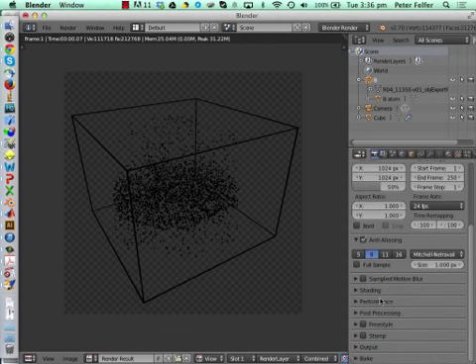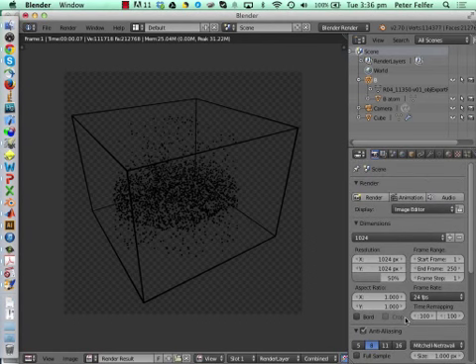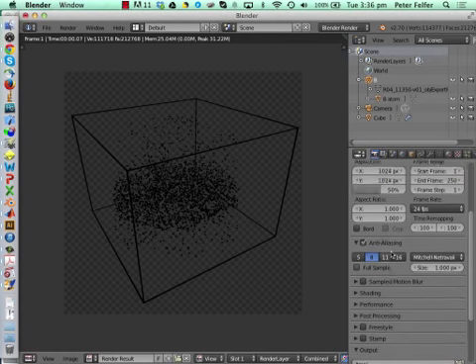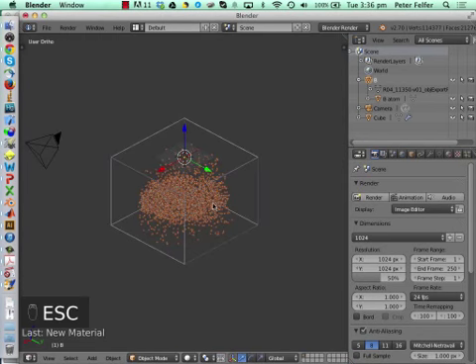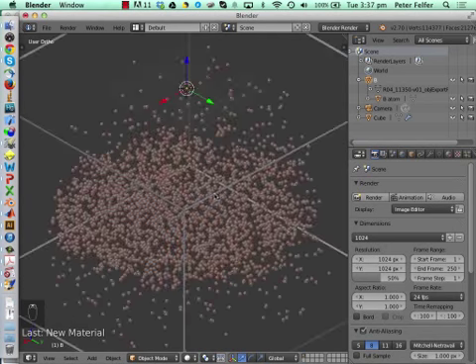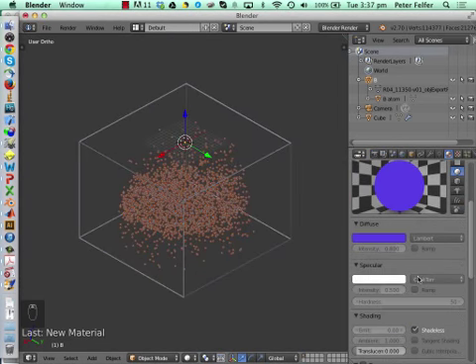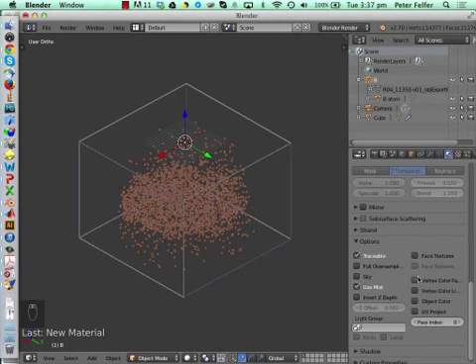Is it still set to black and white? Output. I know, RGBA, that's all fine. Freestyle's off. Alright, that's what happens if you try to demonstrate things. That's actually why we're here, so we don't just learn how to use it, but also how to troubleshoot, I suppose. Did I turn anything on that I should not have turned on?